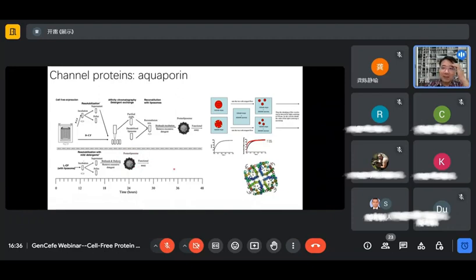And this is a very exciting sample preparation procedure in which we completely omitted the purification steps, where you have to first purify the protein within a detergent and then reconstitute it or destabilize your liposome and so on and so forth. And this is really a big improvement for sample preparation for studying aquaporins.